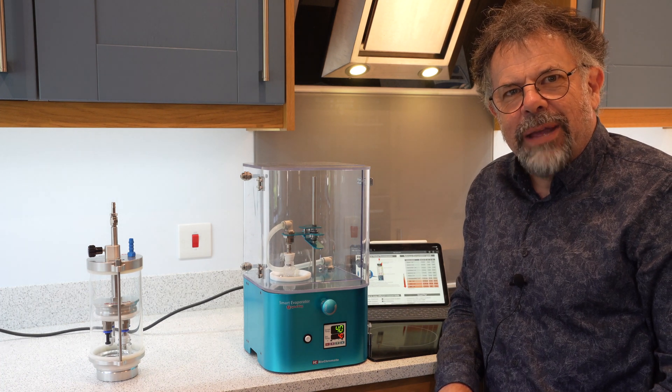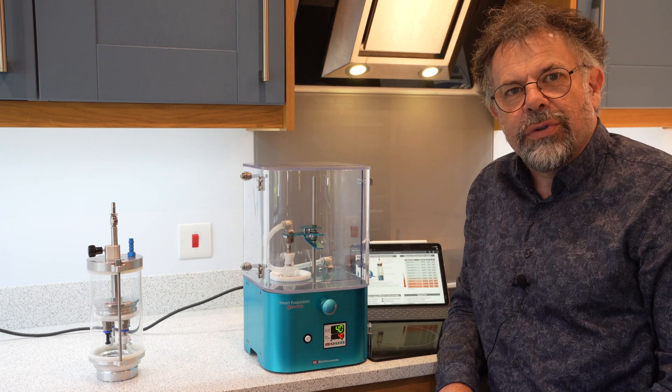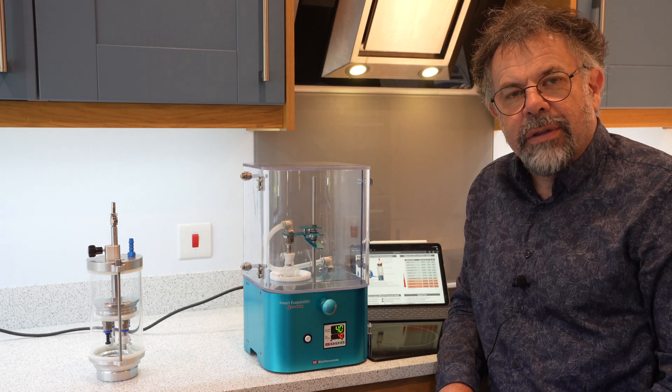Welcome to Asyn. My name is Martin Fordham and today I'd like to introduce you to the Smart Evaporator from Biochromato.